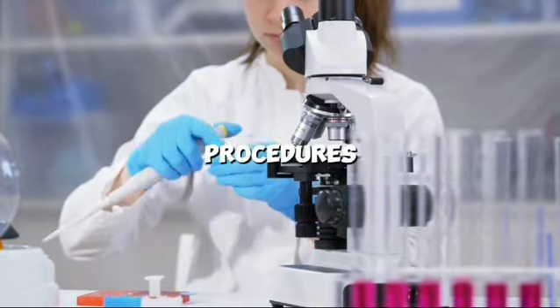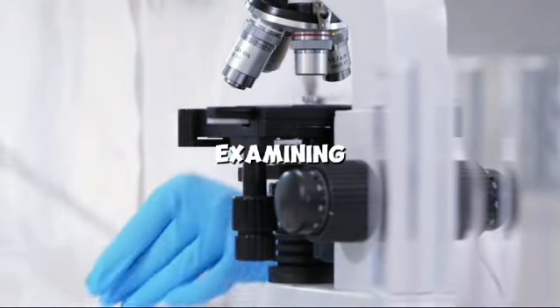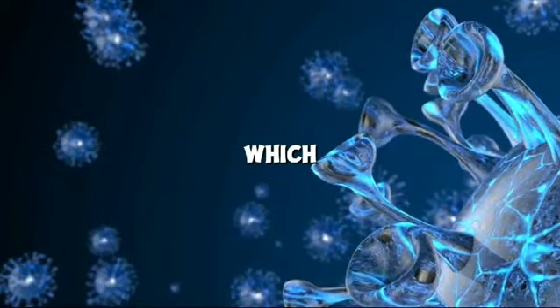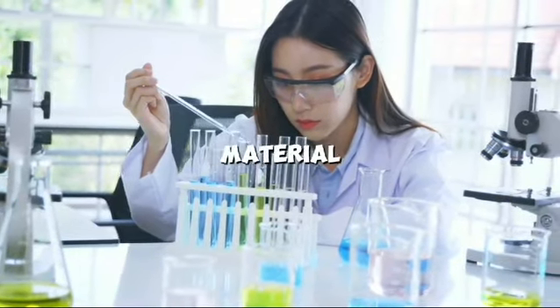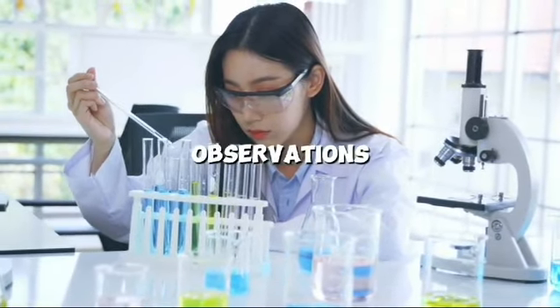Microscope. The microscope is essential for examining small specimens, such as cells and tissues, which are invisible to the naked eye. It plays a crucial role in biological and material science research by allowing for detailed observations and analysis.